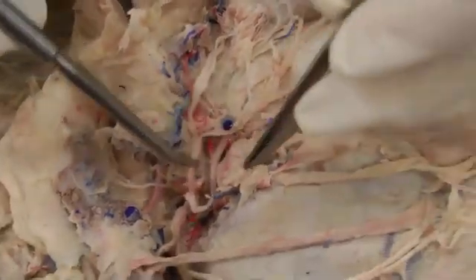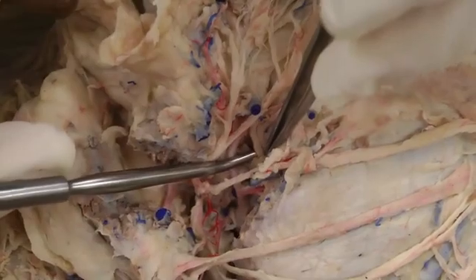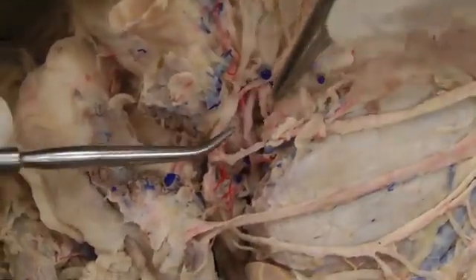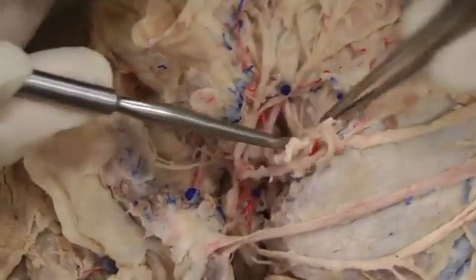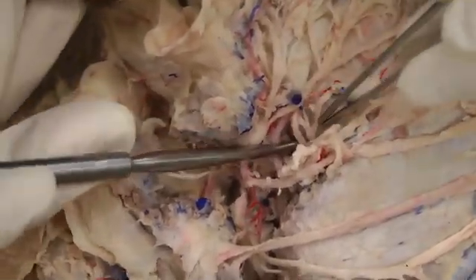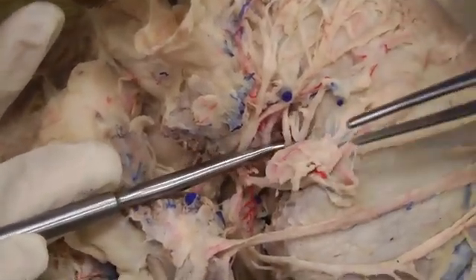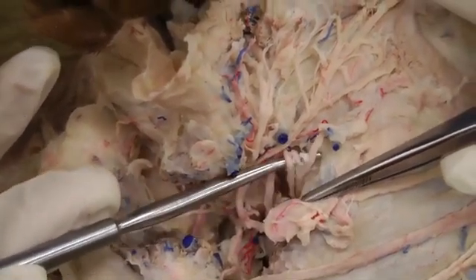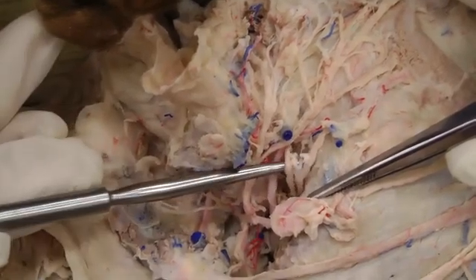One other thing to note in this dissection field: there are some nerve branches coming out kind of deep to and in front of the ear, rather than behind the ear where the facial nerve comes out. These are actually coming off of the mandibular nerve and it's called the auriculotemporal nerve, just giving off some branches there. In that same dissection field you're just looking for those nerves coming out.